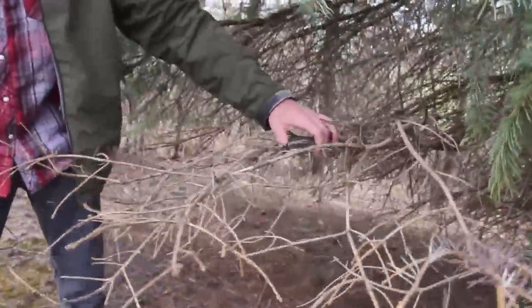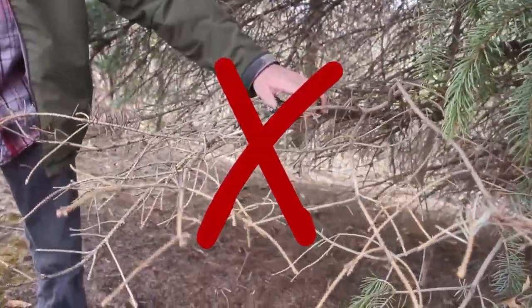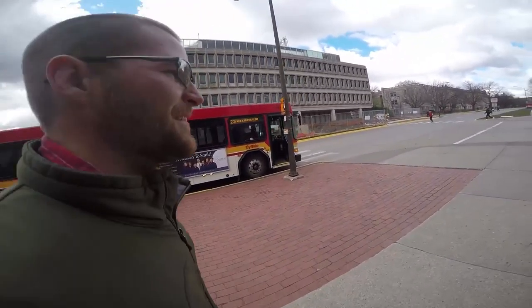A bad sample to send would be something like this, where there are no needles left on the tree, or very few, and the limb is almost completely dead. We won't be able to tell you much from this.